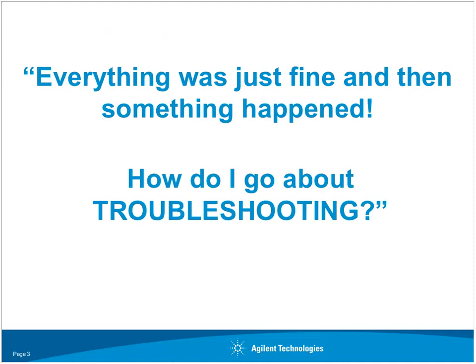So again, everything was working well, and something happened, and how do I go about troubleshooting? So you really got to think about this, and while I make this sound very simple, I realize that your goal is to run samples, to get the results you need for your analysis, to move product, et cetera. But unfortunately, when you do call tech support, there's a series of questions that we have to go through to really help and get to the bottom of the issue.